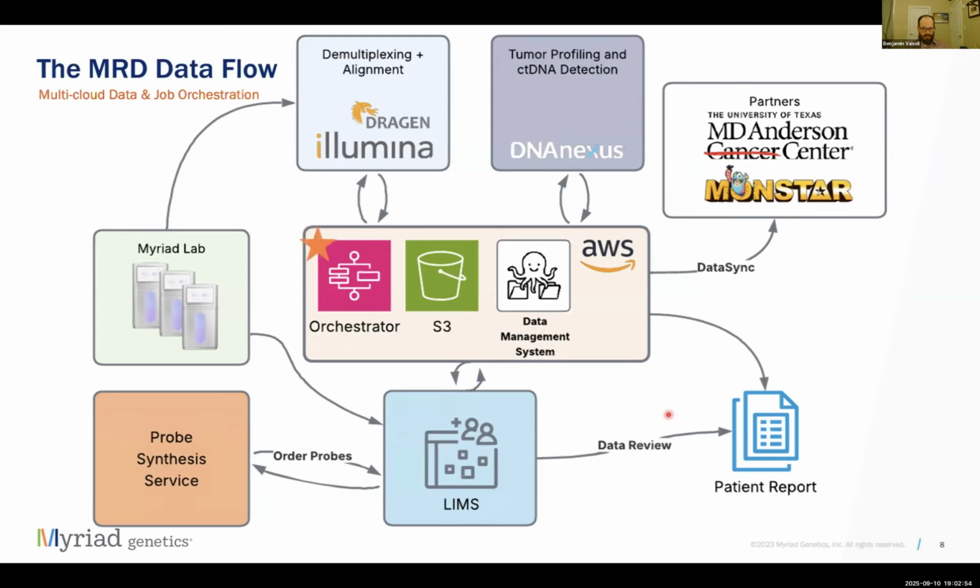The orchestrator is implemented as several state machines in AWS Step Functions. This will be covered in greater detail in Malika's talk. We have the data management system, which is a series of lambdas connected to API Gateway and EventBridge. This will be covered in detail in Eric's talk. Illumina Connected Analytics, or ICA, is connected to our S3 buckets and performs demultiplexing and DRAGEN alignment with a custom pipeline.